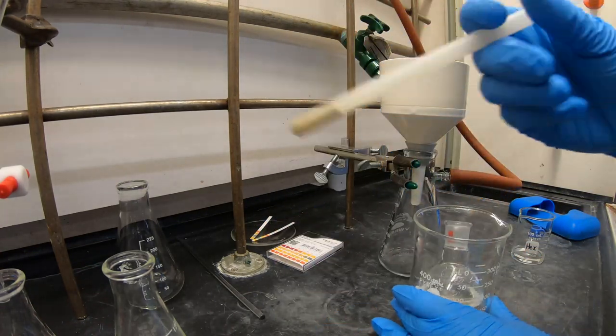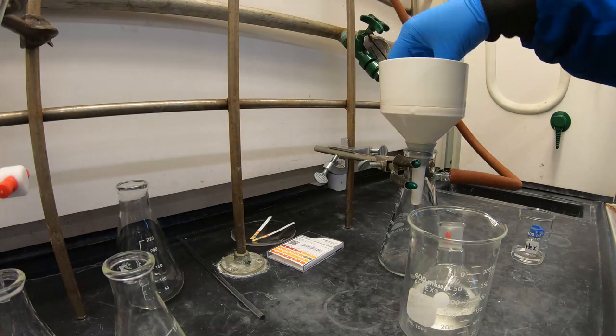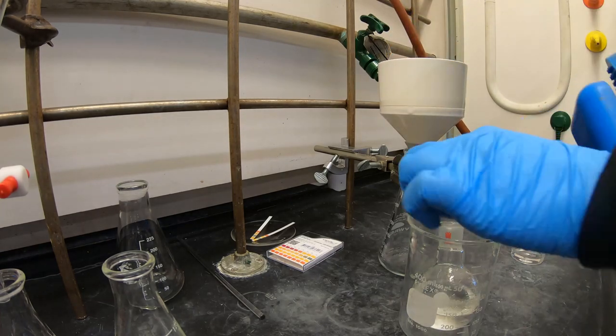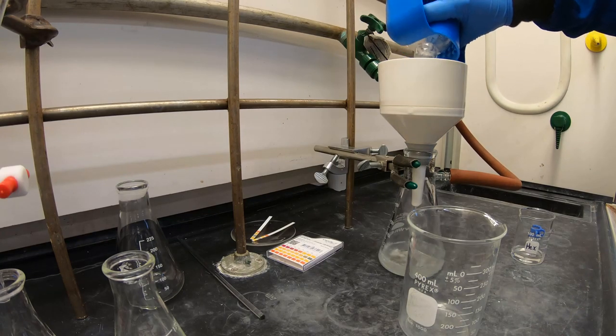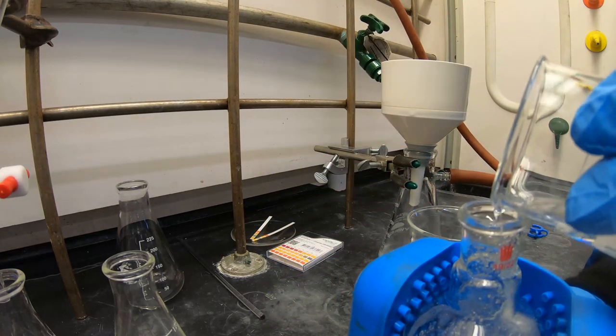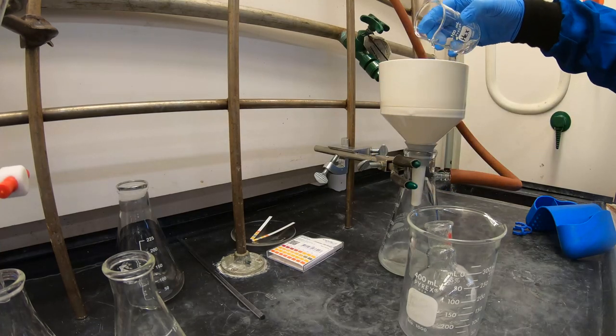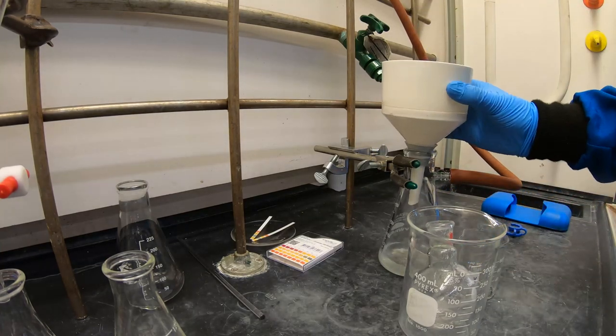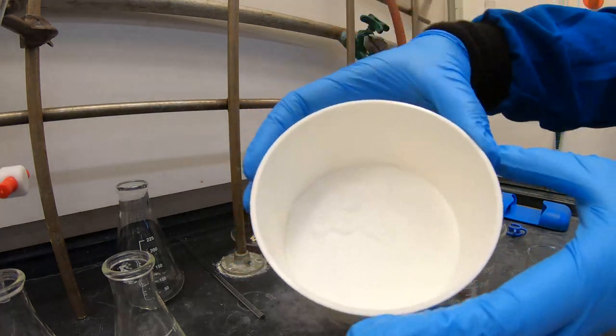Now filter off any solid that has formed using a vacuum filtration system. Rinse the solid with cold hexanes. The solid that has formed during reflux is a byproduct. It can now be disposed of into the waste.